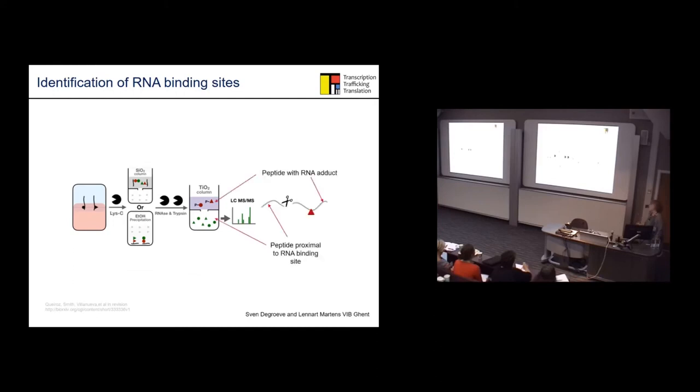By combining different proteases with ways of fishing out peptides that contain RNA, after you've chopped with RNases, you still get sort of a nub of RNA present, which is going to be phosphorylated. We can actually work out the binding sites of where the RNA is on some of these unusual proteins. Many of these binding sites seem to map with domains of proteins which are targets for drugs.